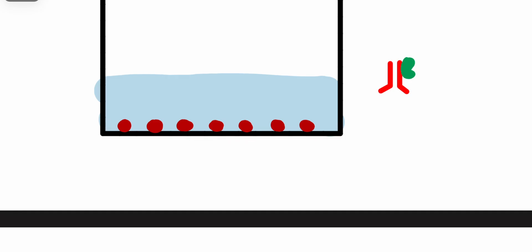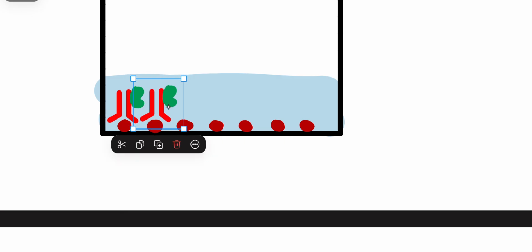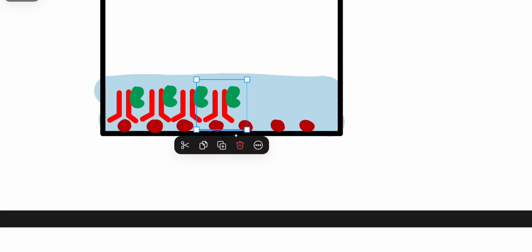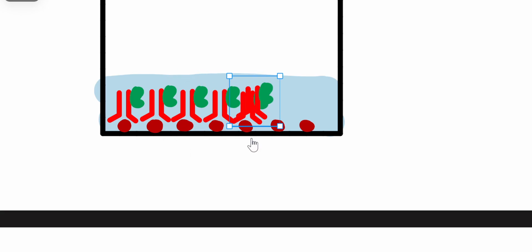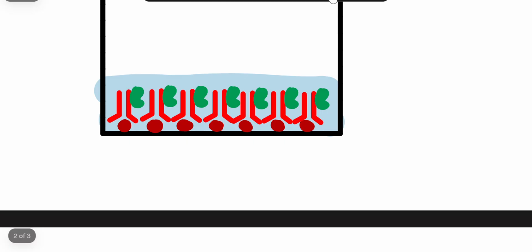Now as soon as the antigens are coated in the well, and we are suspecting whether antigen X is present or not, we add the particular anti-X antibody, which is enzyme linked. So here no primary and no secondary antibody, directly the enzyme linked antibody is used. These are my enzyme linked antibodies. After each step washing is required, to remove the debris and the antibodies which have not bound. Now I'll add the substrate.